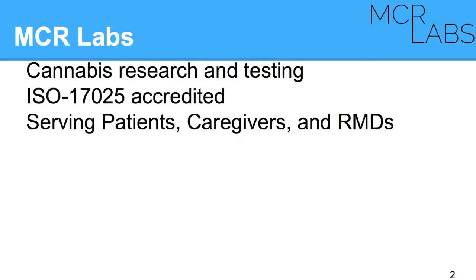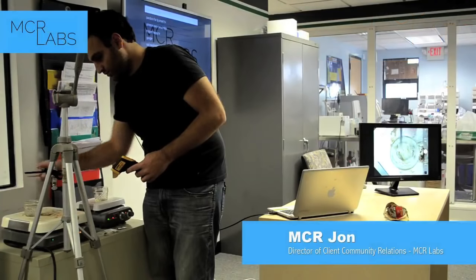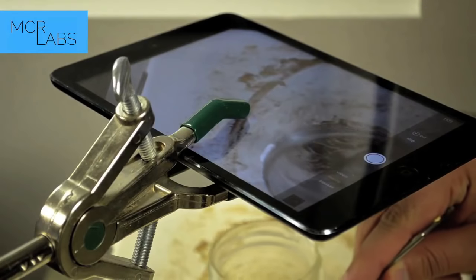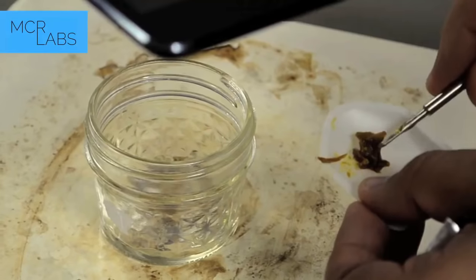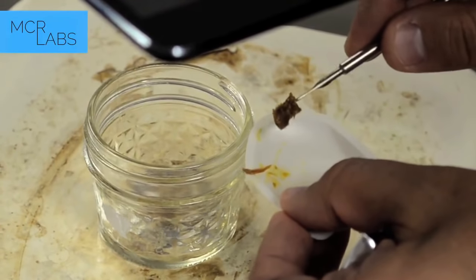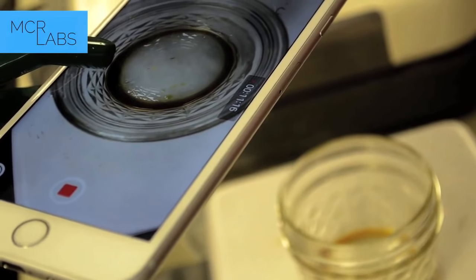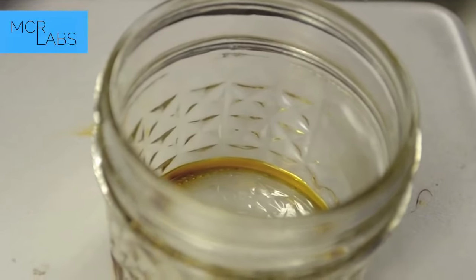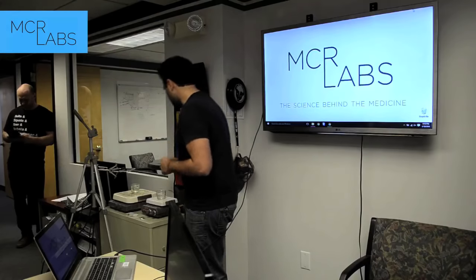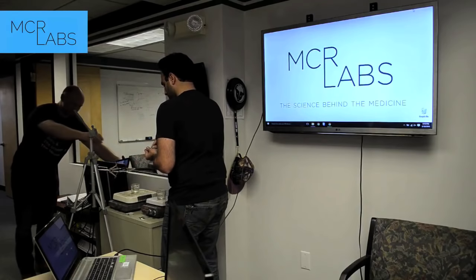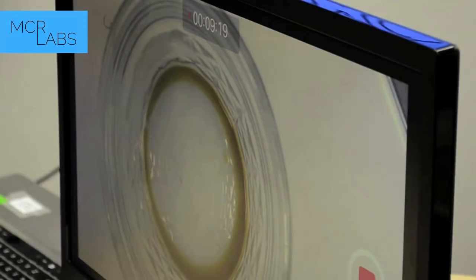I'm going to start the demonstration now — it'll run throughout the talk. We're going to test the oil beforehand and test both samples. I have two hot plates: one on a higher setting just above 300 degrees Fahrenheit, and the cooler plate is around 270 degrees. I did the experiment earlier and got a really nice reaction on one and a slight reaction on the other. Yasha is going to live stream this onto the monitor so we can see what's going on.